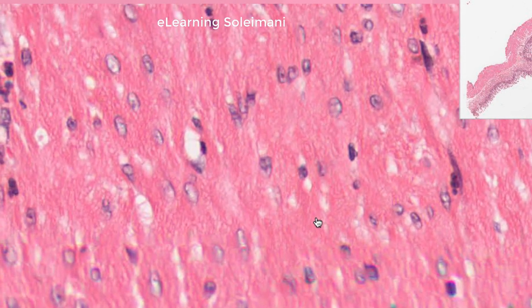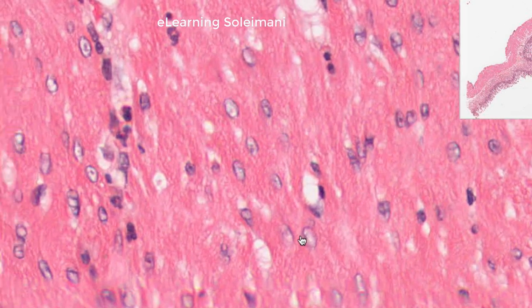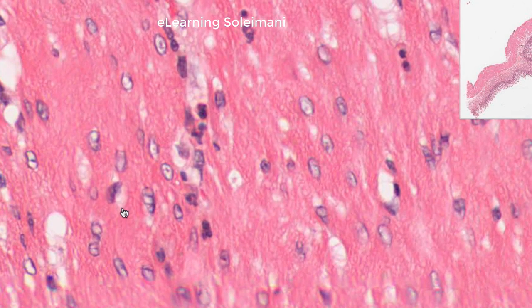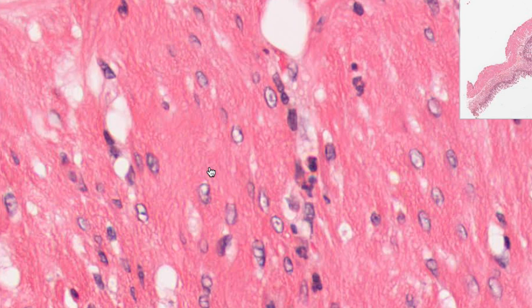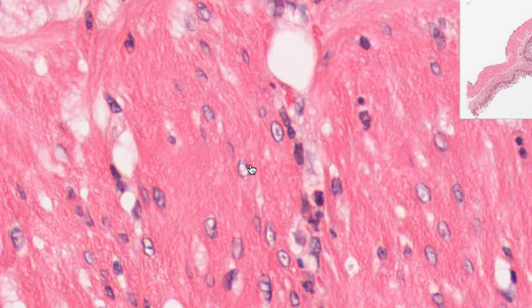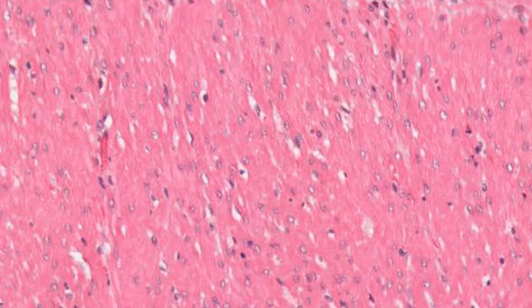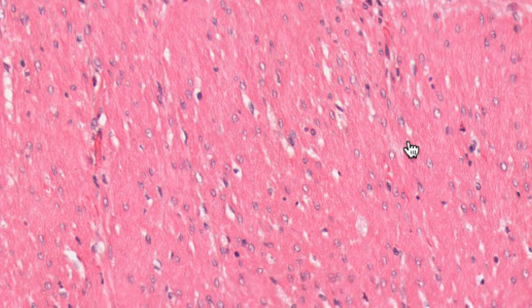In the transverse section of the smooth muscle, different cell sizes are visible due to the spindle shape of the cells. Depending on the location of the slice, some cells may have nuclei and others may not.